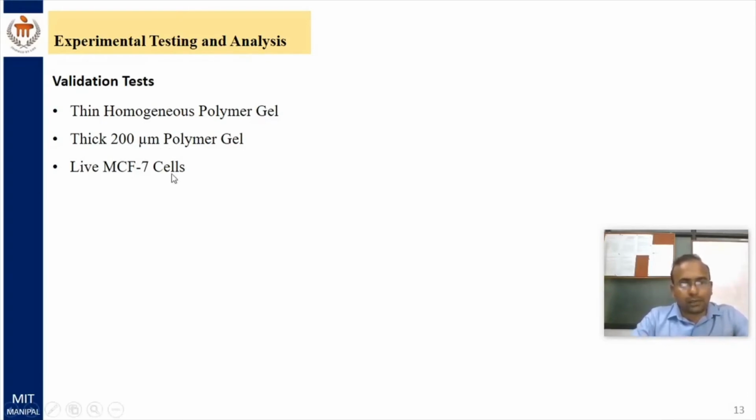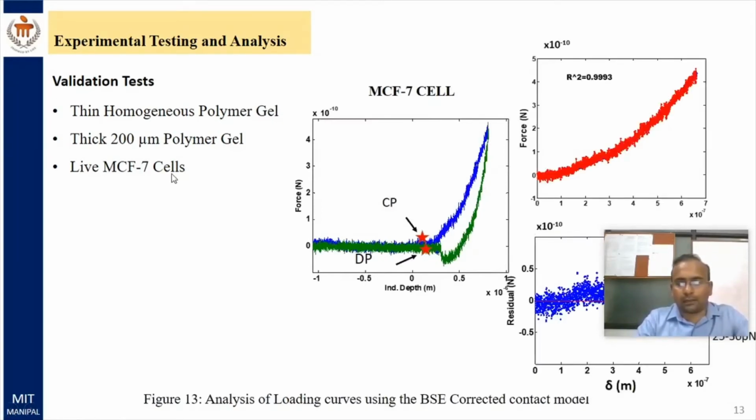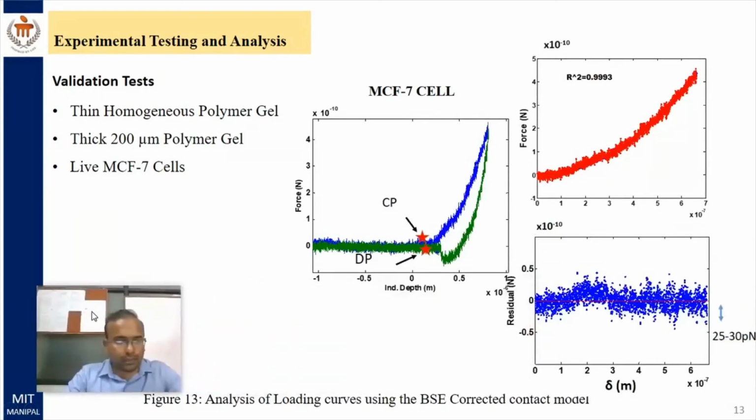The third one is more of an application point of view, and here you can see the analysis of one of the data. The force indentation curve, and the loading part of the curve is taken out and analyzed.